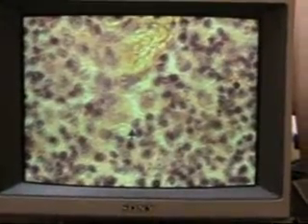And again, whether this is a thymic nurse cell or not, on this thick section, you will not be responsible to pick out the thymic nurse cells, because some of these epithelial reticular cells act as thymic nurse cells. If I had to guess, I would say, yeah, that cell looks like it's inside of that epithelial reticular cell, but I wouldn't, you know.